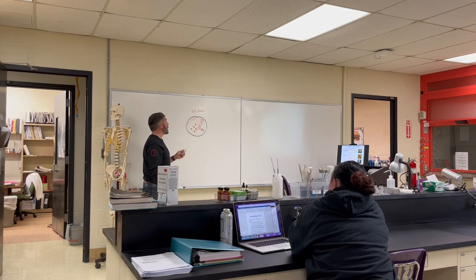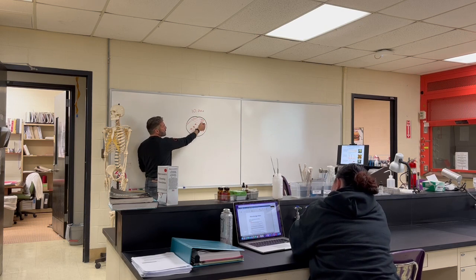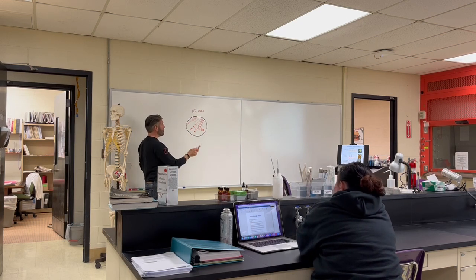So in theory, I went from swabbing this, I had 10,000, sterilized it, 0, swiped it through here, about 1,000, came through here, maybe 23, sterilized it, and as I brought it through here, I dropped off 1 bacteria each. And if they're going through binary fission, in theory, these should be absolutely identical.